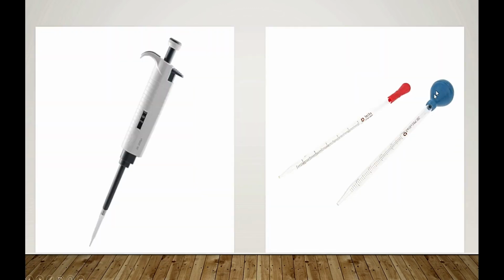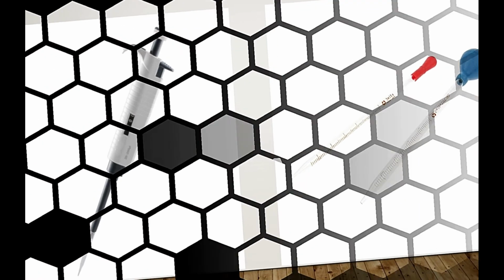Pipettes can also sometimes be used with pipette fillers, or they can be used by sucking through your mouth just like a straw. These are digital pipettes also, which measure very small amounts of liquid in microliters.